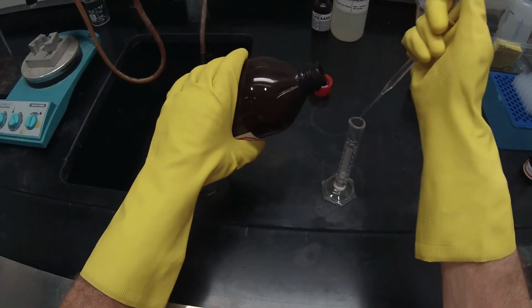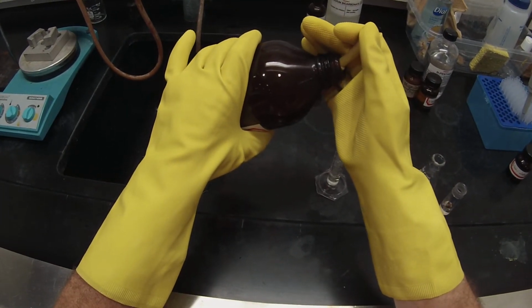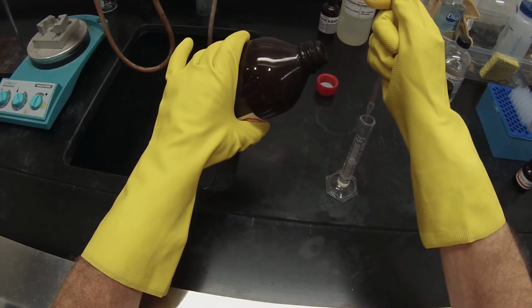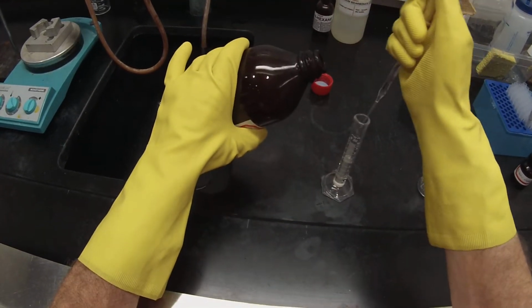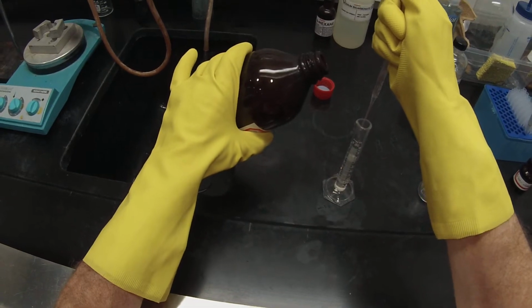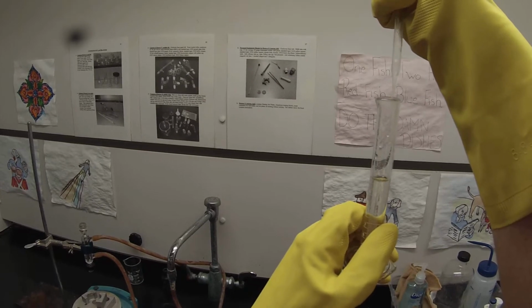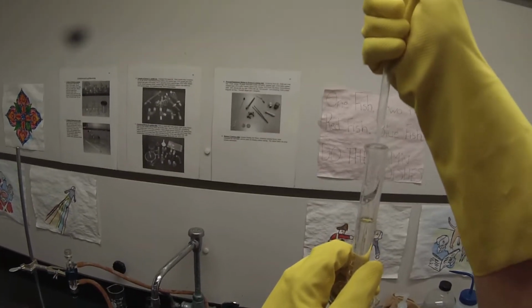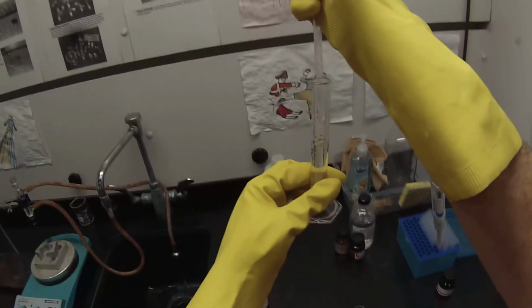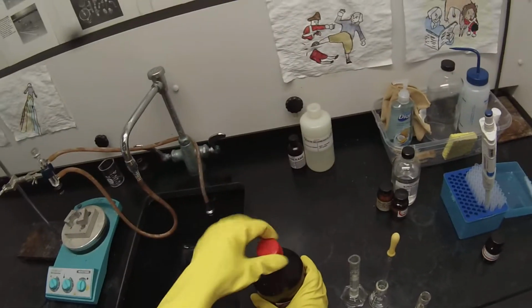There's not much liquid in this bottle, so it's a little bit of a challenge. And each one of those lines is 0.1. So I've got my 7.2 milliliters of acid. That'll allow me to set up 3 reactions. And I'm using this little Erlenmeyer flask just to hold the pipette so the pipette tip doesn't get contaminated.